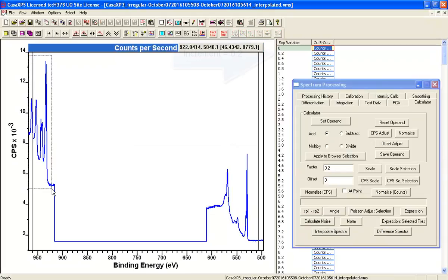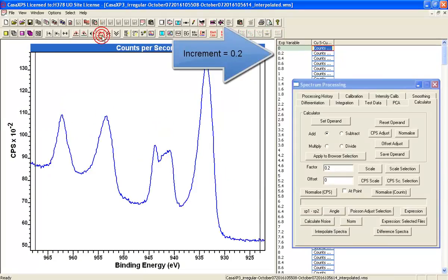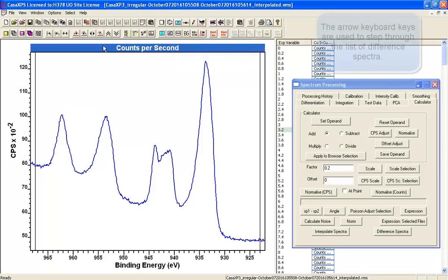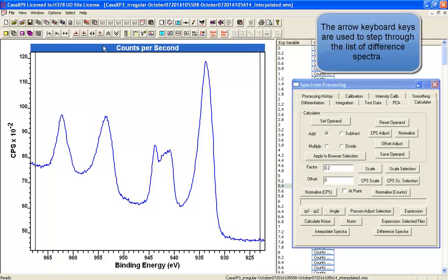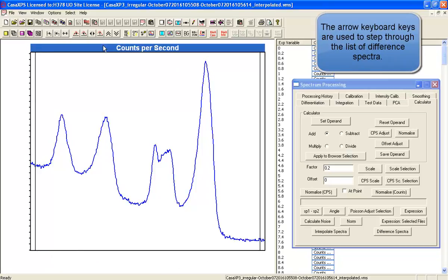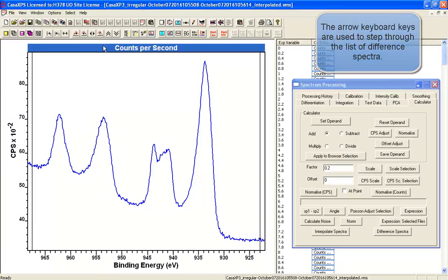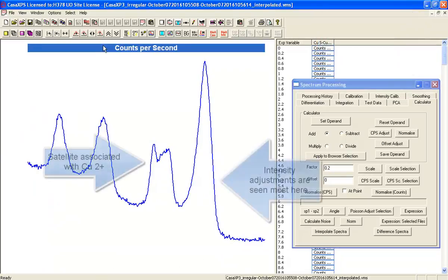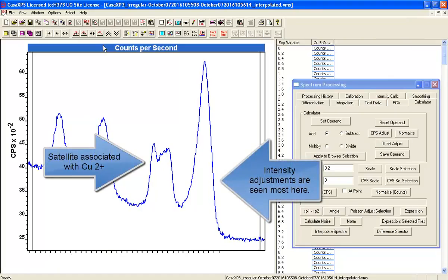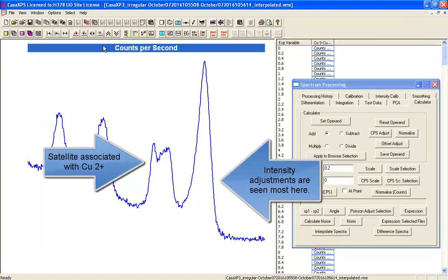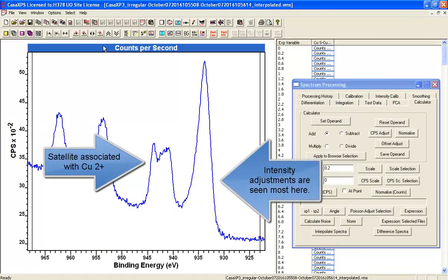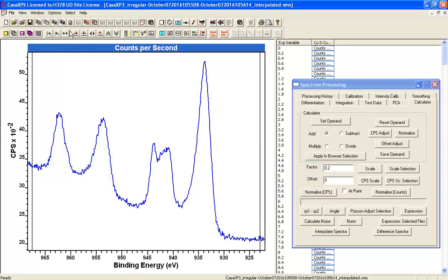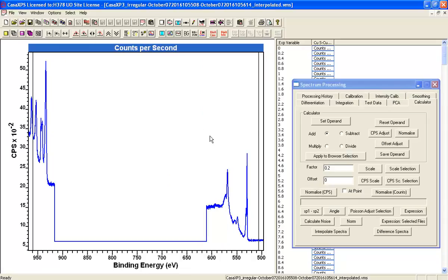So the first thing we need to do after we've created the different spectra is to move through these data and examine what changes might occur. Now, this is a particularly interesting one because you can see there's almost no change occurring in the satellite structures and any changes occurring only in the one-halves and three-halves primary peaks.